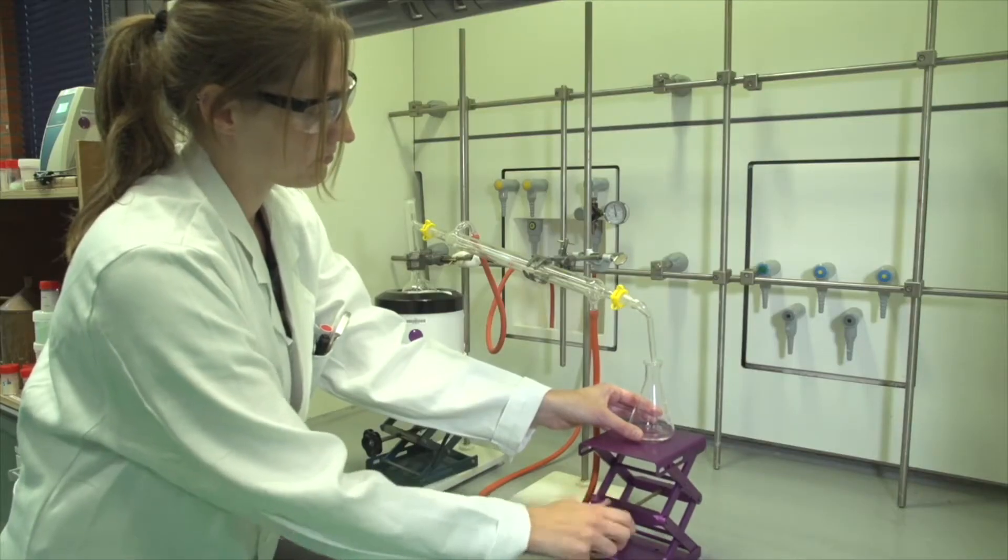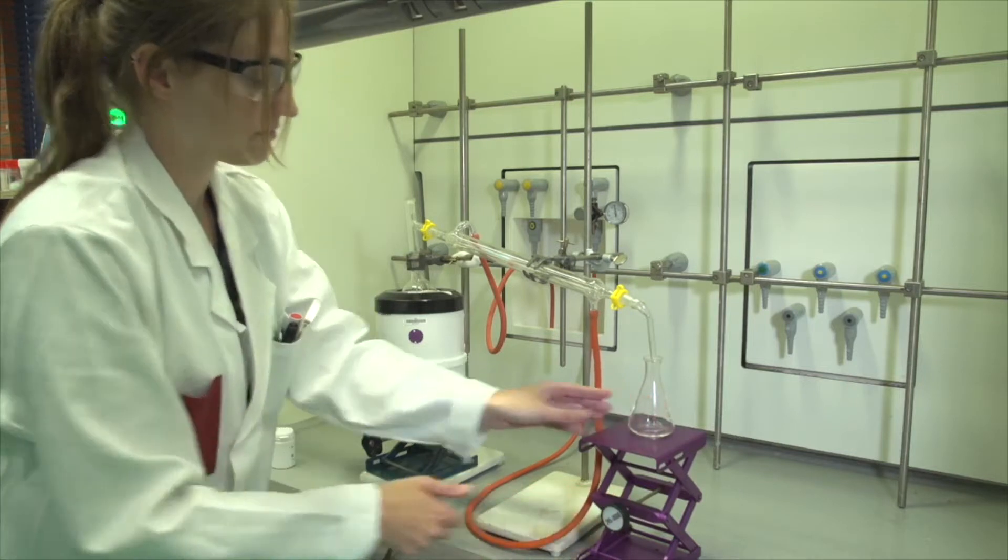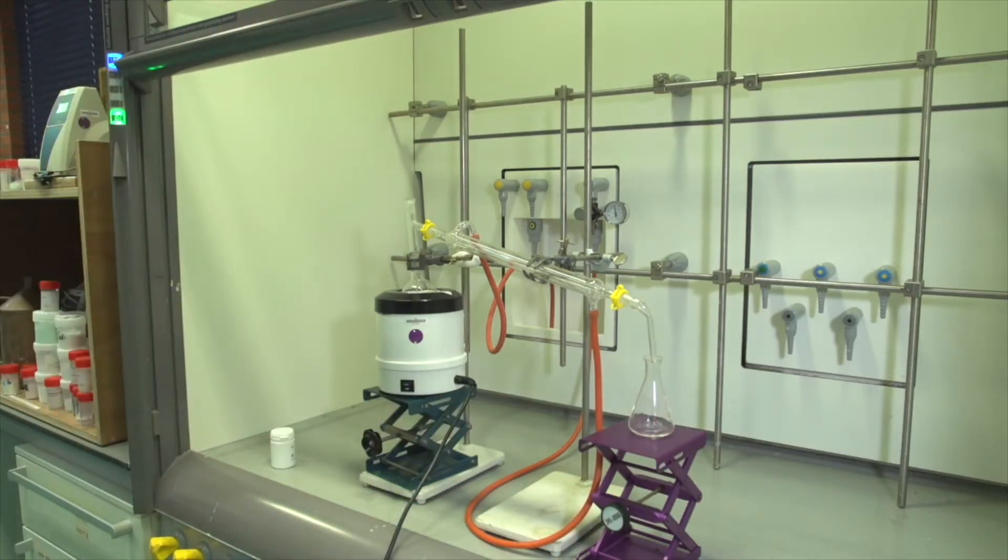To collect the distillate, an Erlenmeyer is placed under the bent adapter. If needed, use an extra lab jack if the Erlenmeyer isn't high enough. If your compound is volatile, you can place the Erlenmeyer in an ice bath to prevent evaporation.